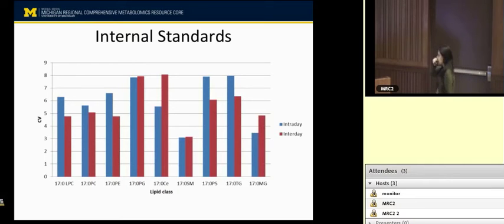So after we run these samples, we first start by looking at the overall TICs to check for any unusual drifts in the retention time, or samples dropping out, or any missed injections, to see if everything went fine. Then we take all the data and try to visualize everything in an unsupervised way and check how the pools look.